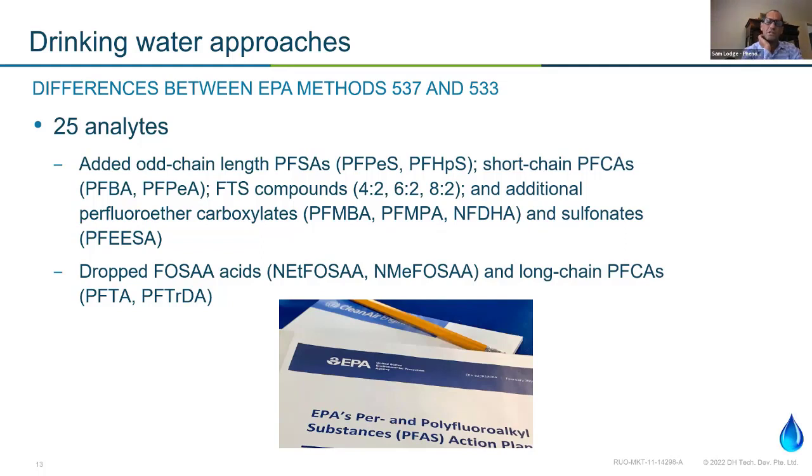One important consideration that I do want to mention: there are a lot of different methods and a lot of different sample prep treatments for PFAS compounds or PFAS samples. What we're finding, though, is as these methods evolve, we're seeing more and more trending towards a WAX solid phase extraction process. I'll go into that in more detail, but that tends to be becoming more standardized.